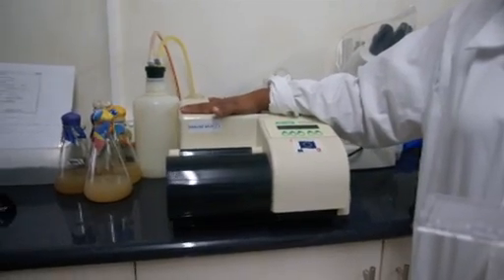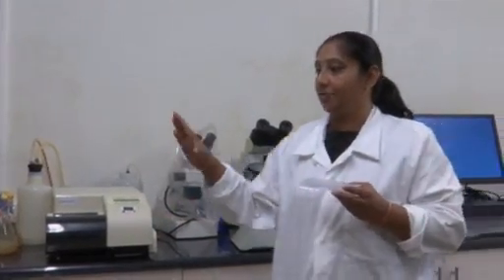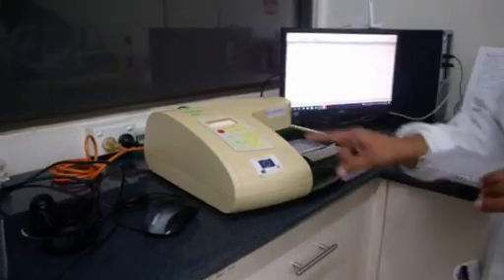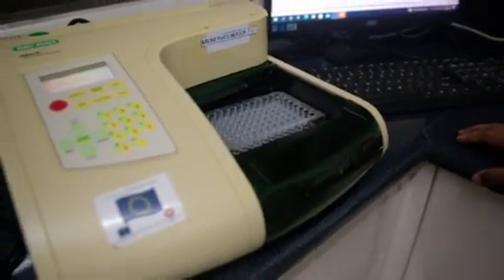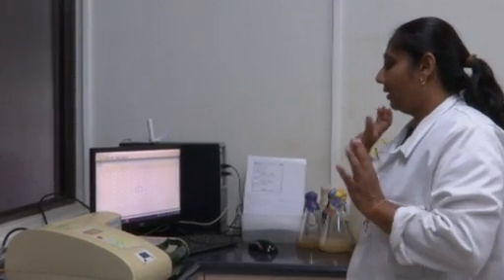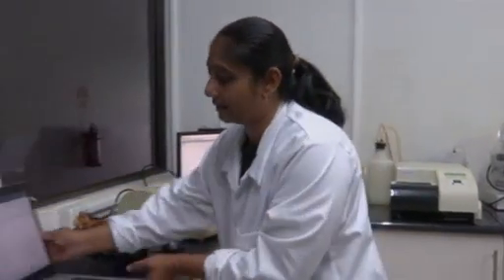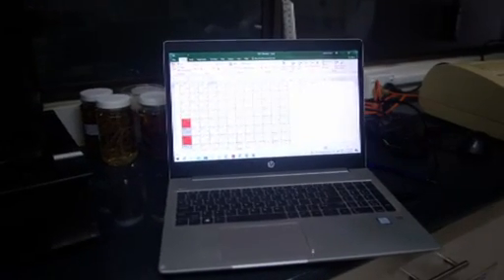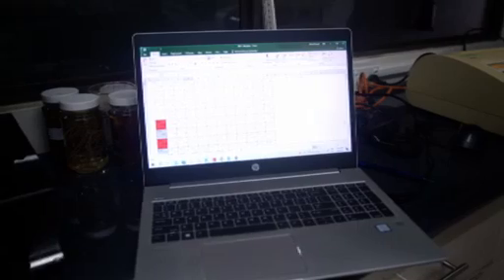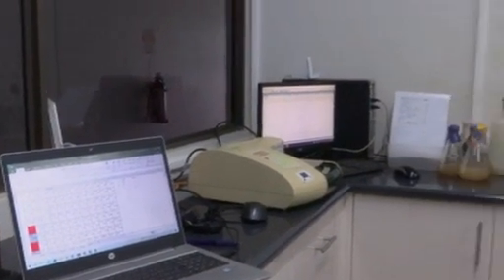The immuno washer will wash the plate and give us the positive and negative samples, from which we take the samples to the microplate reader. In the microplate reader, we analyze the samples, and the machine will generate and give us the positive and negative samples like this. So that is how we identify whether a field is infected with RSD bacteria or not, whether a field is positive to the disease or not.